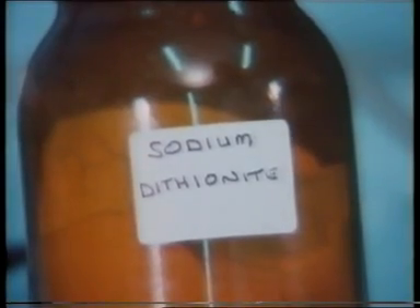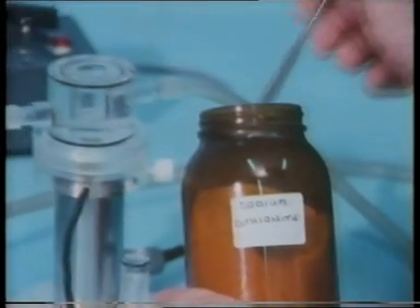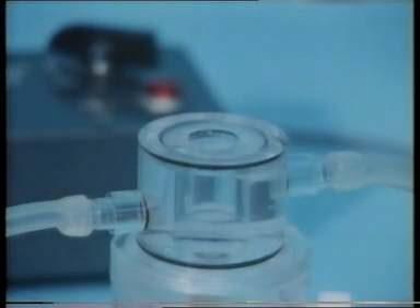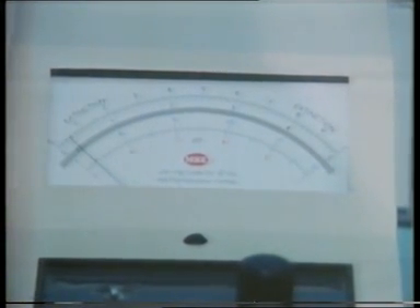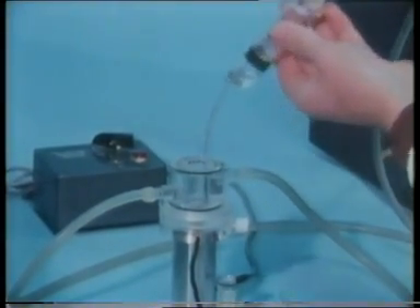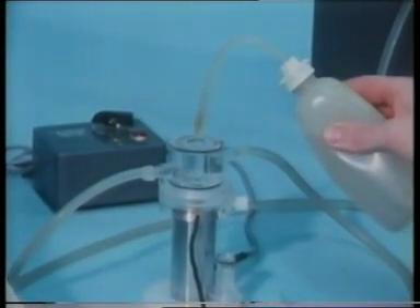If we now add a reducing agent, such as this sodium dithionite, which will use up all the dissolved oxygen, the voltage rapidly falls to zero. We now remove that liquid from the reaction vessel and clean it out, so that we can start our experiments using mitochondria.